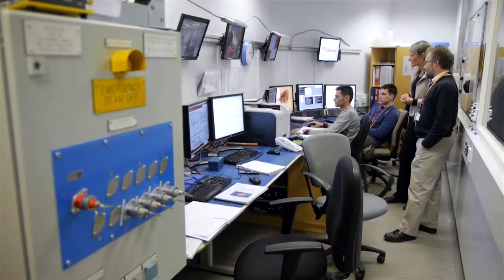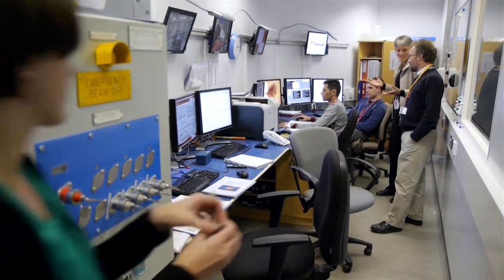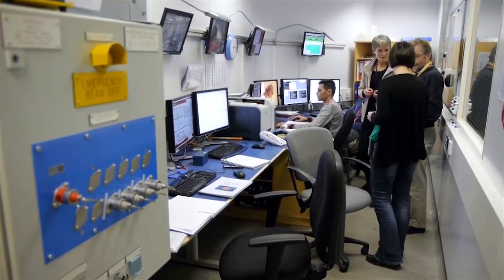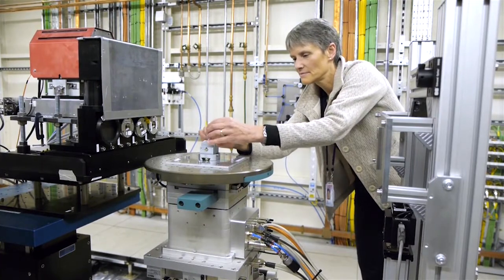We're right at the end of a 4-day experiment where we've been looking at corrosion behaviour of stainless steel. This week we were supporting Alison Davenport and her team from Birmingham, who came here to study corrosion as it happens. We're looking at it from the perspective of long-term storage of intermediate level nuclear waste.